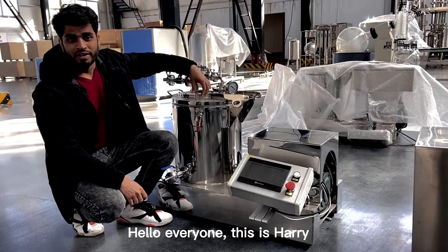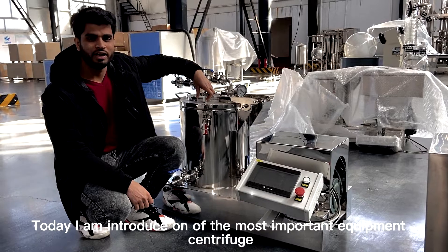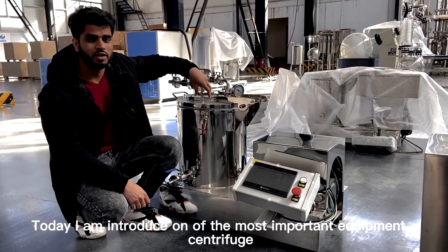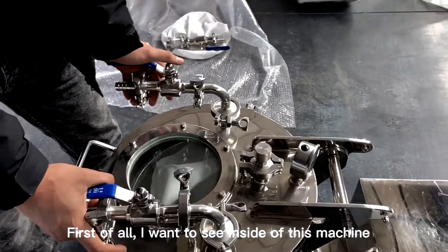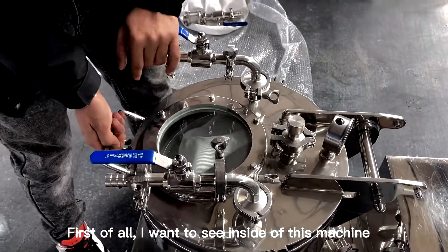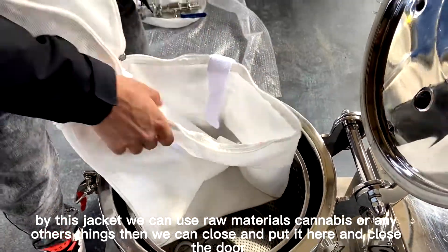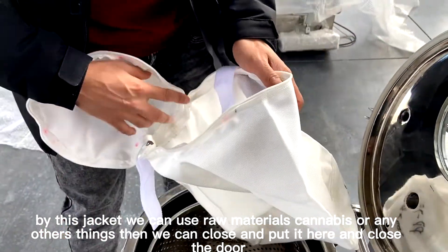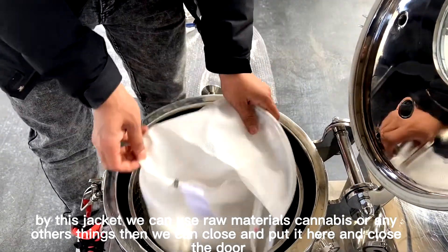Hello everyone, this is Harry from Hennel Platform Industry Company Limited. Today I am introducing one of the most important equipment — the centrifuge. First, I want to show inside the machine. Inside we have a jacket. This jacket can hold our raw material, cannabis or any other things, and then we can close it.